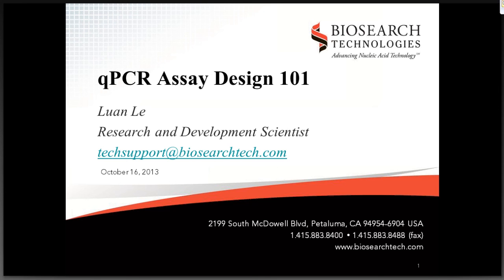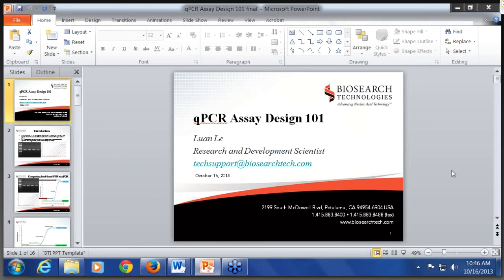The other inherent issue that you might run into with multiplexing is there's a wide level of competition associated with multiplexing. For the most part, for new users, we don't recommend you multiplex more than 2 at a time. For advanced users that are familiar with primer probe optimization and changing different aspects of their protocol and their assay, it's definitely possible. We've tested in-house up to 5 dyes before. I guess the more complicated you make it, the more room there is for problems.